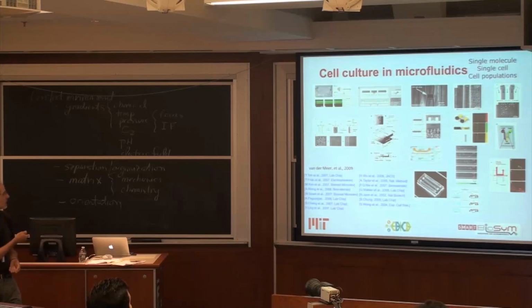And this is just a collection of some of the different types of microfluidic systems that people have had. I thought it'd be useful for you to have this slide. This has a lot of the references, so I can't say which reference connects with each individual picture, but here are some that have occurred, and most of these, I guess the oldest one dates back to about 2002, so you can sort of see how the field has evolved over the period from 2002 to, in this case, about 2008.